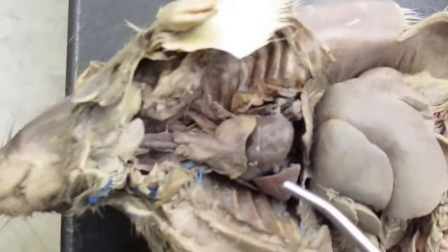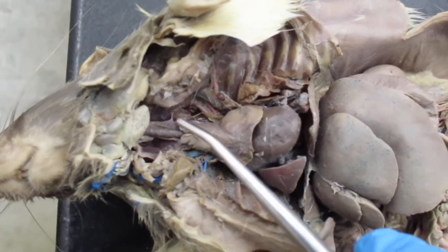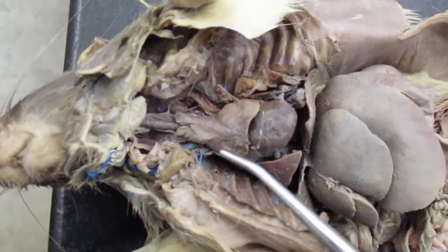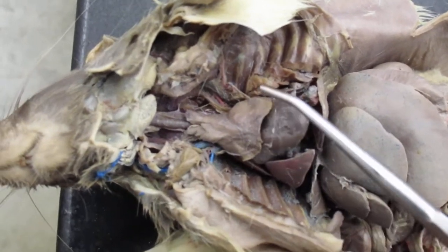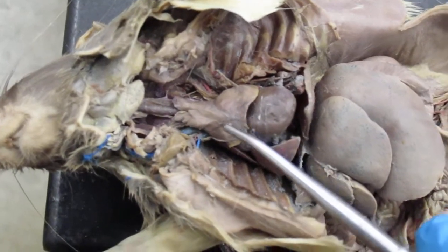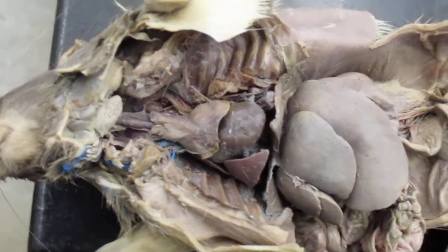Let me show you on the rat here. You can see it a little bit better. So you can see the rat here. You can see the heart. You can see your thymus right here. That's what I'm circling. The thymus gland. It's going to be both superior and anterior to your heart. Okay.